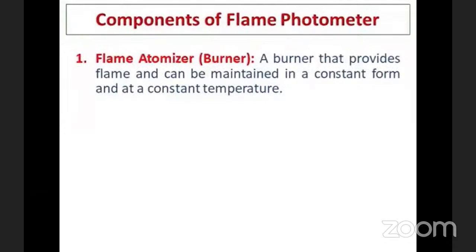A burner provides a flame that can be maintained in a constant form and at a constant temperature. The sample is usually introduced into the flame in the form of an aqueous solution.